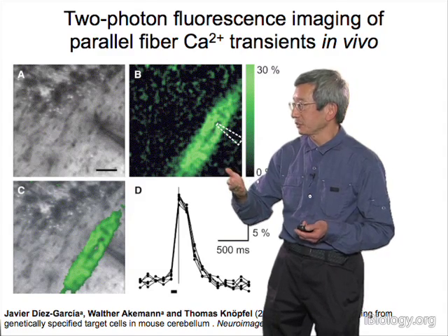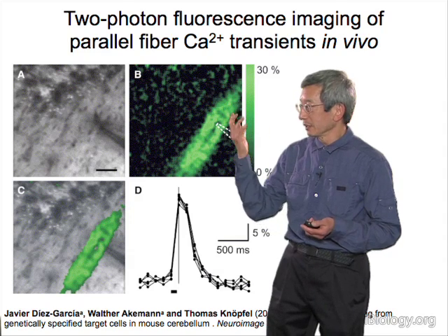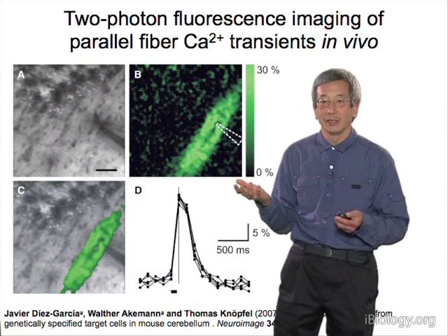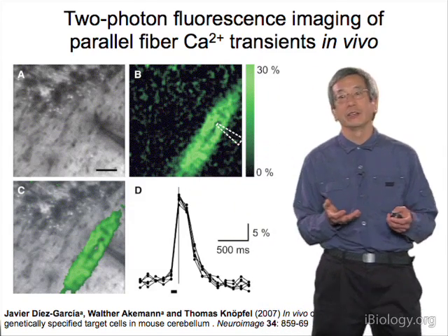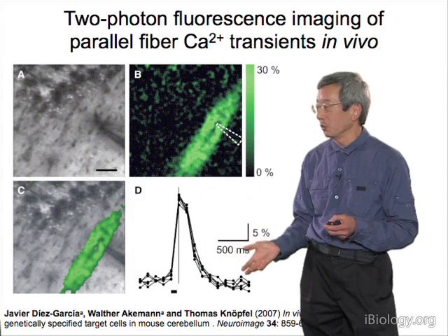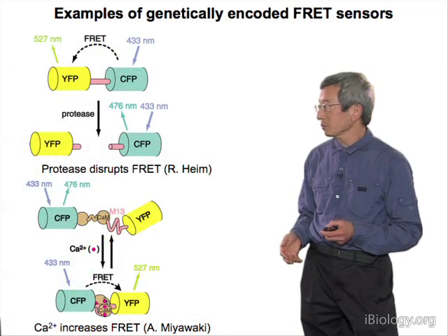And when they are electrically stimulated, they let in some calcium through voltage-operated calcium channels. The GCaMP is expressed inside these cells and momentarily flashes bright. And with that, we can get spatial maps, again, of where the neural activity is occurring inside the cell. There's a lot more recent work, but I picked this example, which is a little bit older, because it's a very simple case to explain.